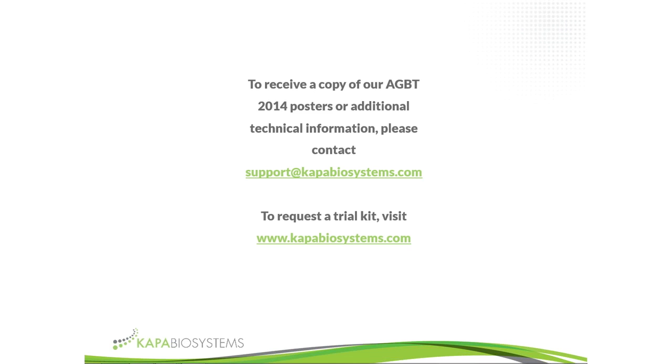Excellent. Another question is, does adapter quality impact percent conversion rate? Very much so. All of what we talk about with adapters, we're always assuming that all adapters in an adapter solution are fully double-stranded. As you know, the Illumina Y adapter has a very short double-stranded segment at the base of the Y, only 12 base pairs, compared to another 48 or so bases on each oligo that are single-stranded.